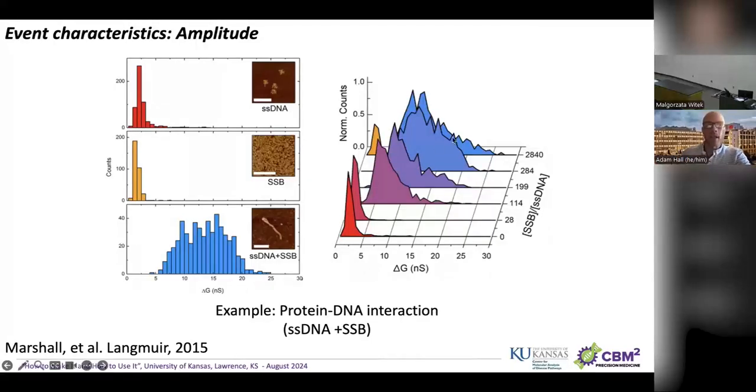And we've done some kinetics on this over here, but this is just showing you, through the exact same simple measurement that I already talked about, that you can start to get some actual biochemical information out of the device.